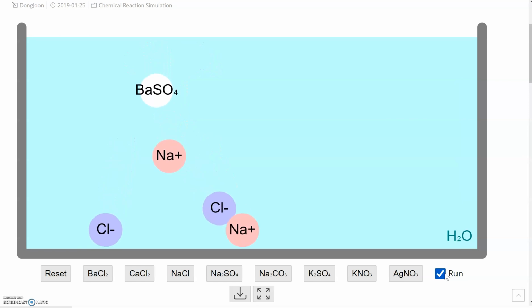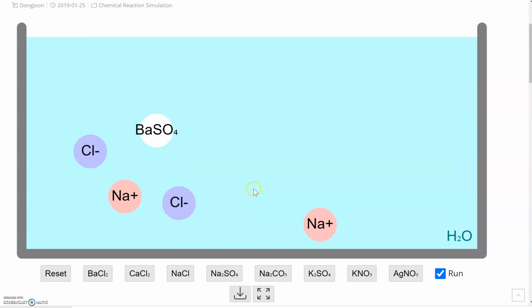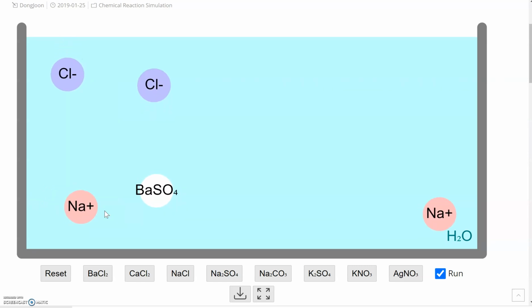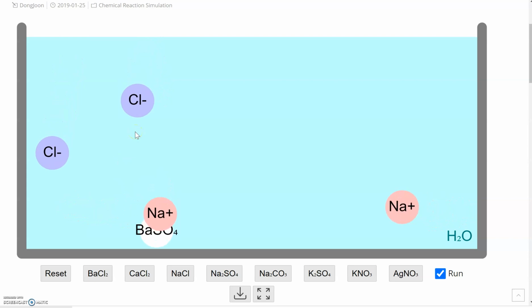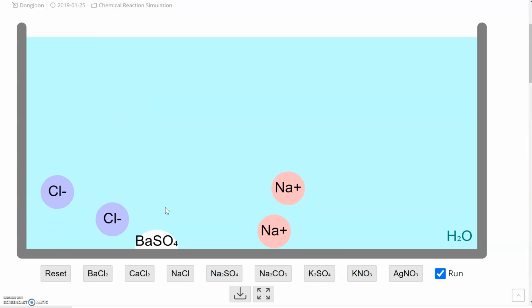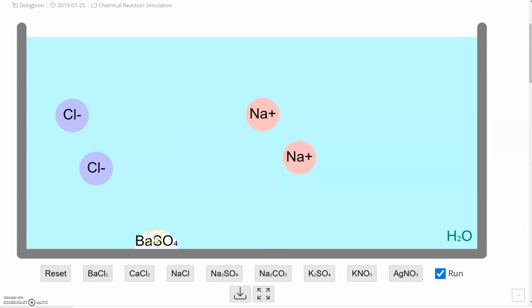The 2 ions combine to produce a precipitate that literally falls out of solution and lands on the bottom of the water tank with a squishy sound like this. You don't really worry about that. But if I am asking you to capture a screenshot of your precipitate on the bottom of the water tank, this is what we mean.